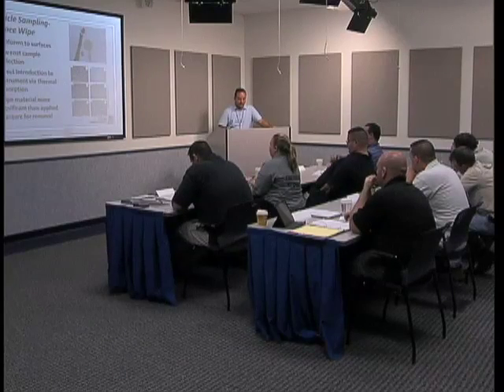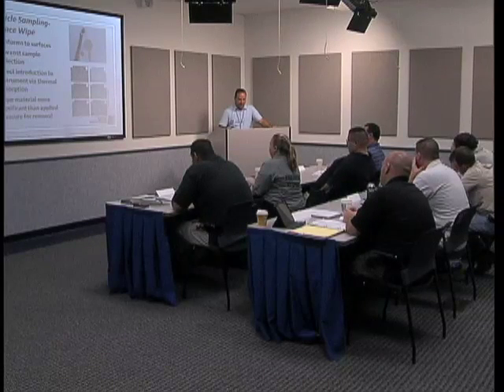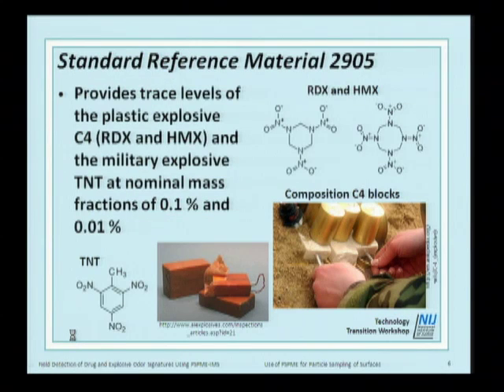Okay, so we're talking about particles, but we're also interested in these volatiles. So PSPME offers the opportunity to do both. We have a mechanical removal of these particles onto the surface, and Patty's already talked about the particle sampling using surface wipes of different composition, different material, and she said the material is more significant than the pressure.